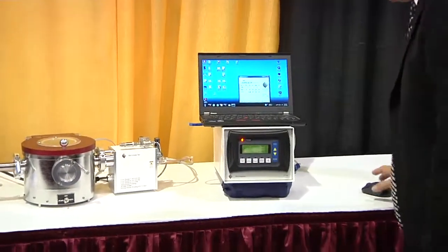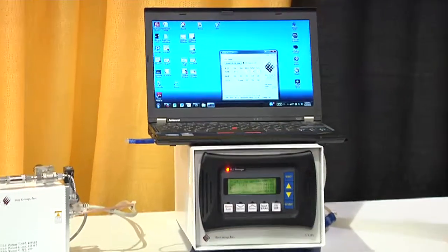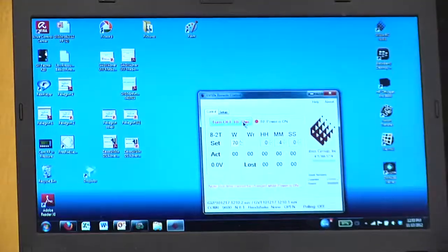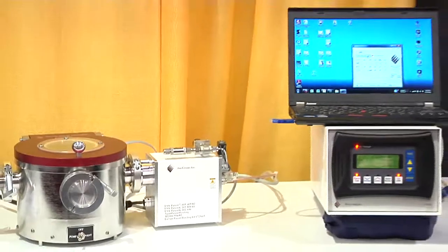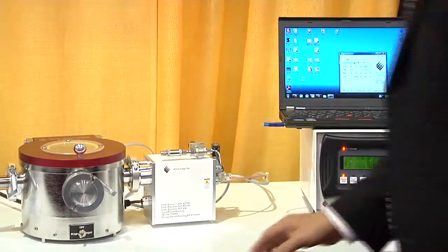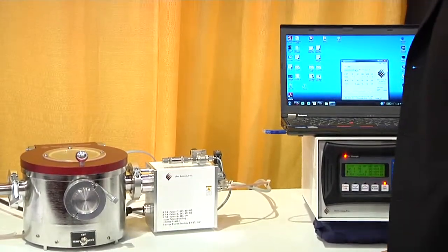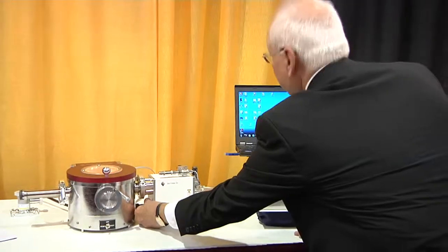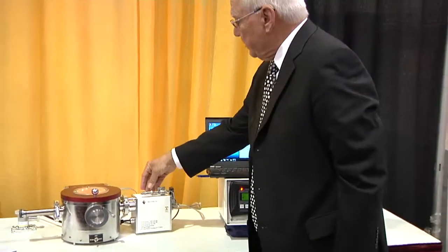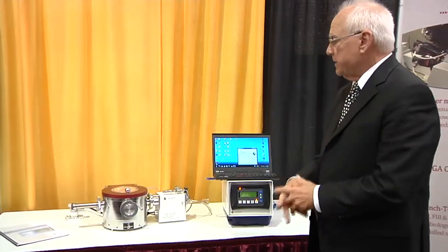The timer has turned it off. I will turn it back on by our user-installed software. This opens a valve and emits the gas with which we are cleaning — in this case, it's air. And the plasma strikes — let me do it again. There we go. The plasma development here puts atomic oxygen into the SEM, and that's what oxidizes the hydrocarbons.